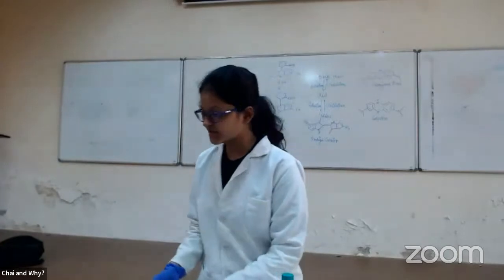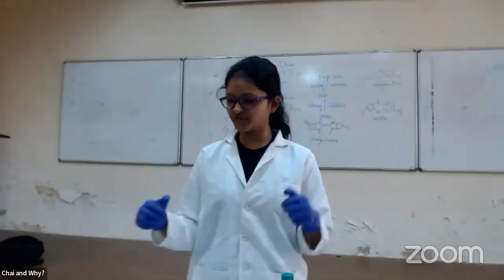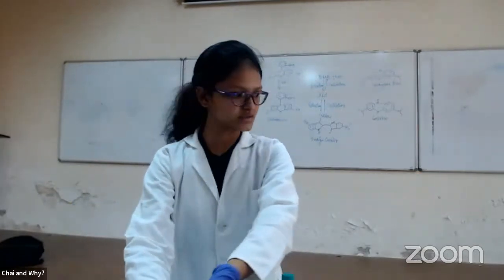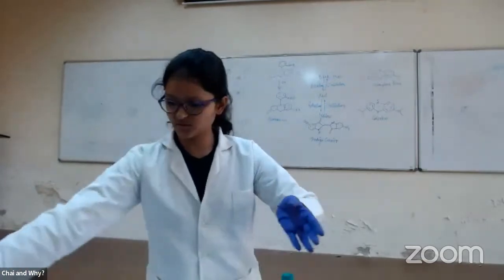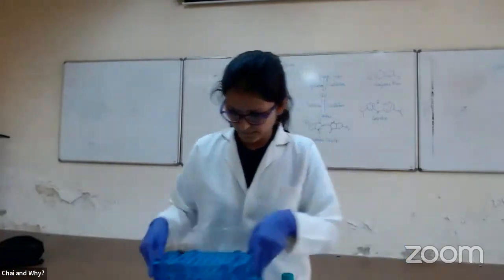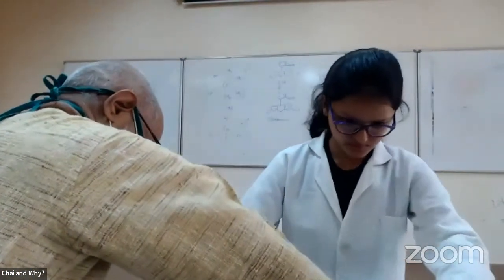Now, because the session is all about the colors from my lab, I'll show you here the different colors that we have. So I'll tilt the camera. Okay, is it fine? Wait. Okay. You want to use which color? This one? You want to use this? Or do you want me to just bring the bottles in? Bring the vials in front of it and turn it by 90 degrees, and I will switch to that camera.